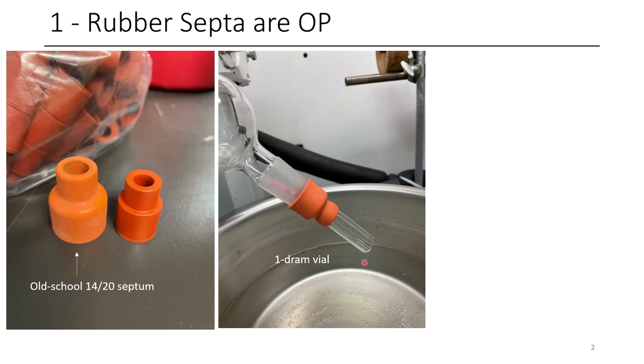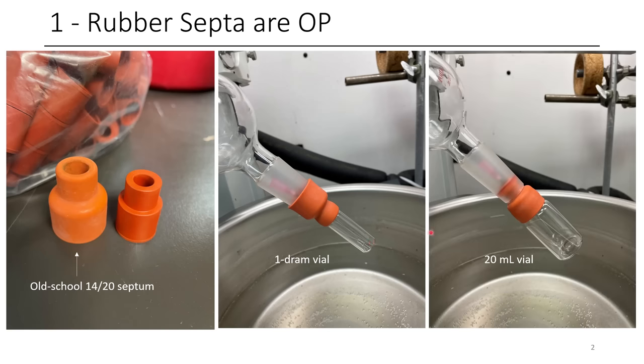And so while this is pretty good for rotovapping stuff down right into the vial that you're going to keep your compound in, you can also do it into a 20 mL vial if you have more sample. This is a really useful trick. It's very useful because afterwards you can just connect this onto a vacuum line and high vac it off.